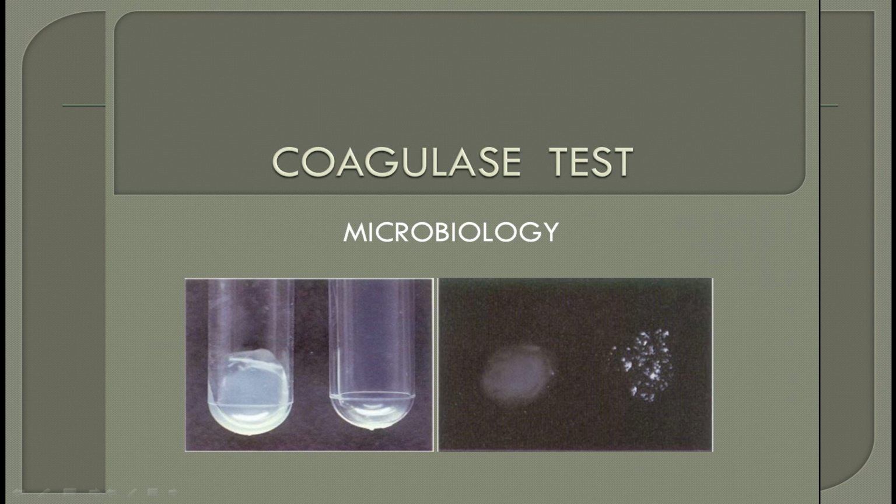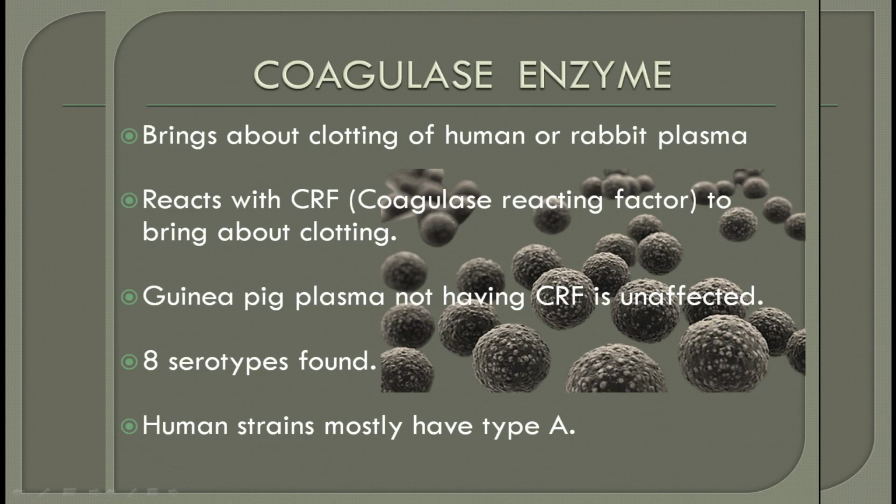Alright. So, with that being said, let's talk in detail about this coagulase test, which is not much, so this will be a short discussion. Let's get everything correctly sorted out this time, and understand what this test is all about. The first thing we talk about is the very basis, the fundamental of this test, which is the coagulase enzyme.